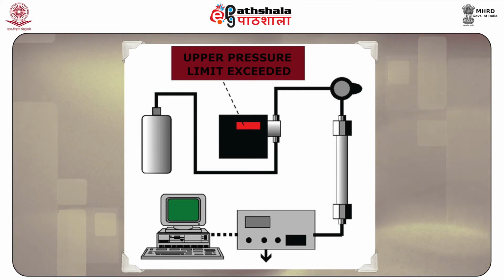Along with this, the average particle size of HPLC is also comparatively smaller, ranging from 2 to 50 micrometers. The high resolving power of HPLC makes it a popular analytical technique.